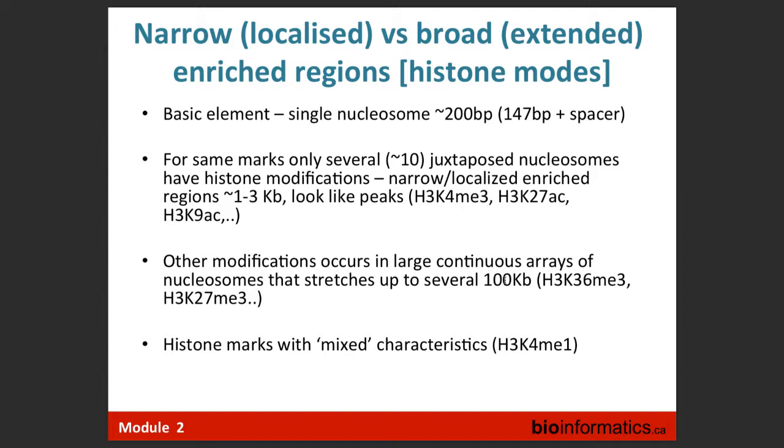When you look, what are our eyes actually looking for? We look that we have a peak. Then we look at the flank of this peak, okay, it winds down, nothing. And then I look at the input. In the input, I look at the flanks, this level, I look under the peak, also nothing. That's our general principle. We look at the enrichment in location A, so it's different from the flank. We look at the input, it's not different.